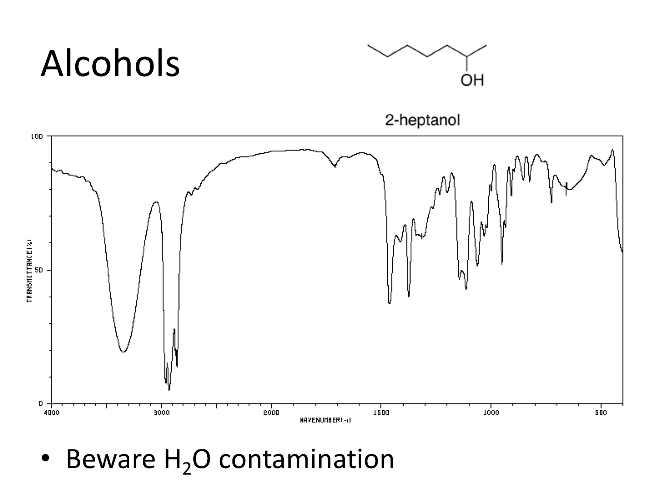All right, so one of the big easy things to see on an IR is if you have an alcohol. An alcohol has two key peaks. The most important peak is probably this one on the left. You guys haven't seen that before, right? If you look, it's a peak that's above 3,000 and it has a very broad shape. It's very rounded. So it looks different than all the other peaks, which are more sharp and spiky, right? An OH is always going to look like that. Now, sometimes if you have a sample that has water in it, it might look a little bit like an OH, but it'll be much, much smaller compared to the size of all the other peaks. So we won't have to worry about those.